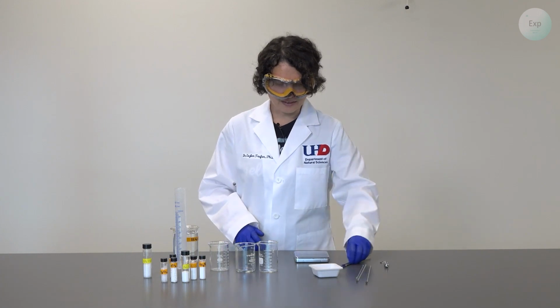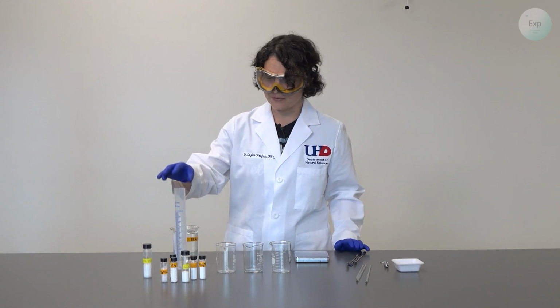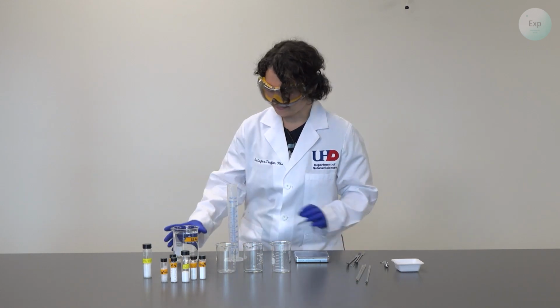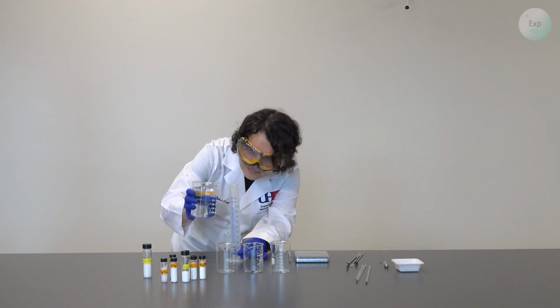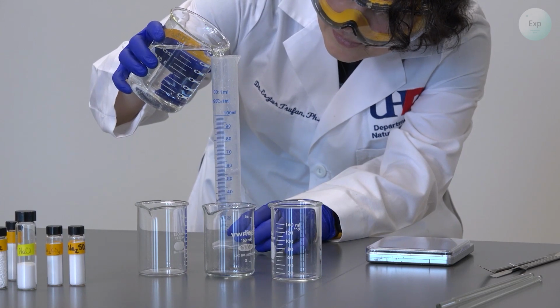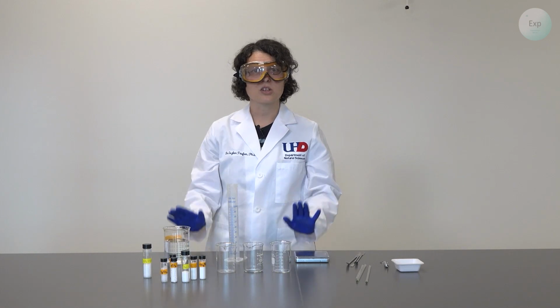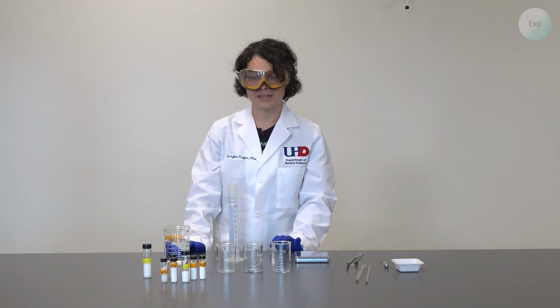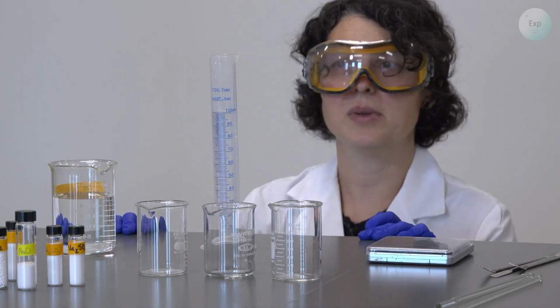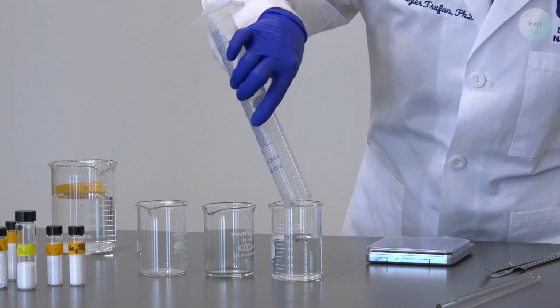So let's get started. The first thing that we're going to do is measure out 100 milliliters of deionized water into 3 150 milliliter beakers. For this measurement, it is really important that we get as close as possible to the 100.0 milliliters. And in our first measurement, we have 99.9 milliliters of water. We transfer this into our first beaker.